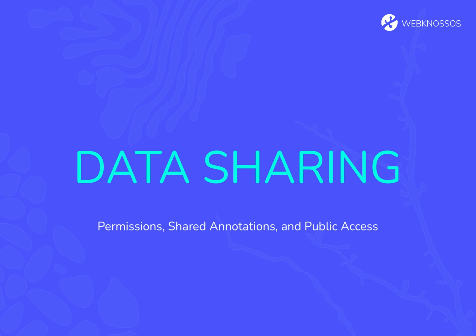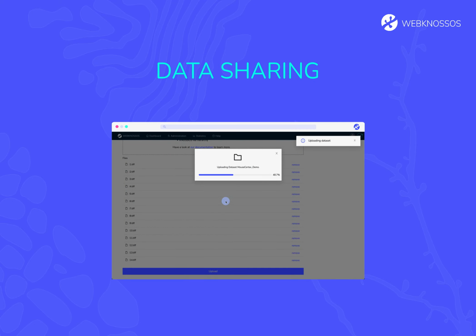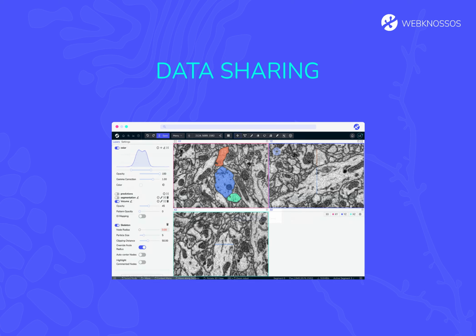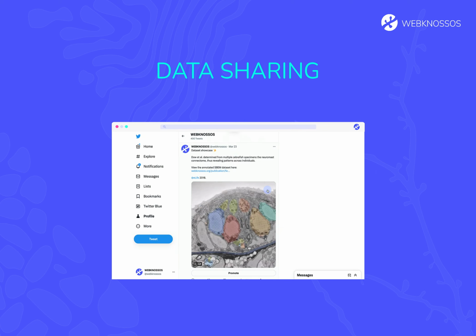WEBKNOSSOS makes the sharing of large 3D datasets extremely easy. In this tutorial, we will show you how to upload and organize datasets, collaborate on annotations, manage access permissions, and make your data publicly available.